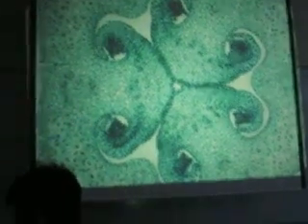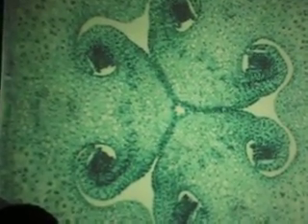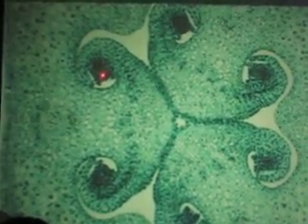Okay, back to slides again. Number 13. Now, you're going to have 4 cross-section ovaries on your slide, times 6 ovules, so you've got 24 ovules. Of the 24, how many are good? If you're lucky, maybe 3, maybe only 2. So, garbage, garbage, garbage. These all look like garbage. Is there one with 1 cell somewhere? They all look bad. Well, that one doesn't look too bad. Higher power. There we go. I was right. See? That's the megasporocyte, or megaspore mother cell.